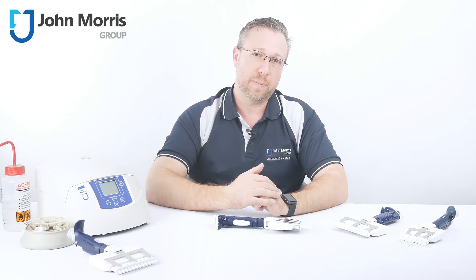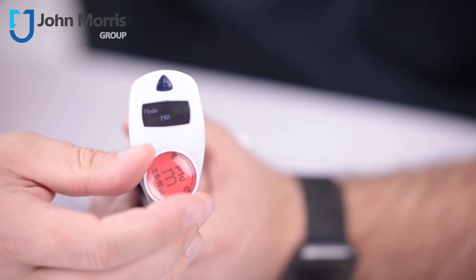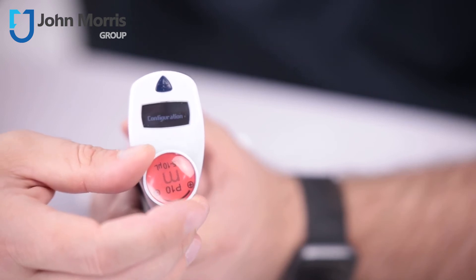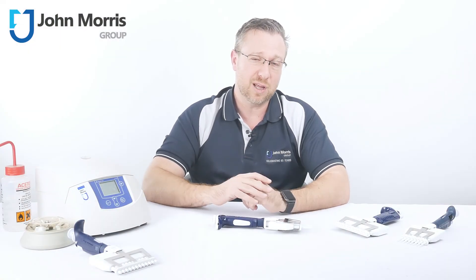Five: all electronic pipettes across the Gilson M-Series are intuitive to use. They have only two buttons — the smaller one is to access the pipetting modes, and the larger wheel is for changing these or for setting speed or volumes. Just like all of the newer pipettes across the Gilson range, it's virtually impossible to accidentally change volumes, and with the M-Series you can even create your own protocols which can be downloaded to the pipette via the Pipetman M software.